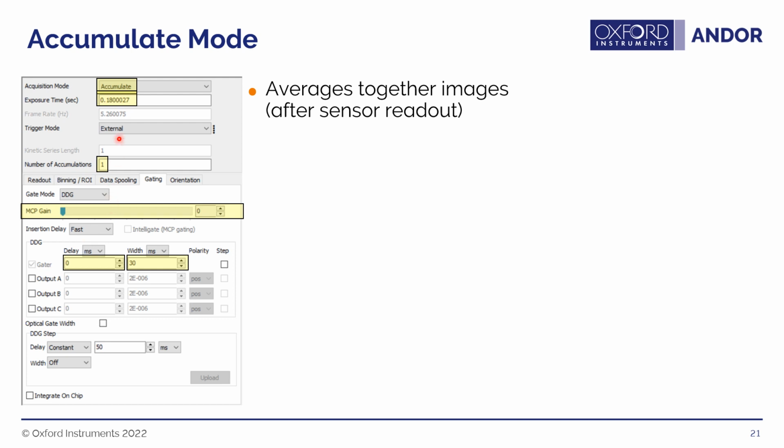And especially anytime you make other changes to the exposure and anytime you start a new acquisition, again, start the gain down at 0 again and only increase it once you've determined that the signal is not too high and will not damage the intensifier. And then, as with last time, you can play with the delay and the width of the gate pulse and see that on the oscilloscope screen as well.